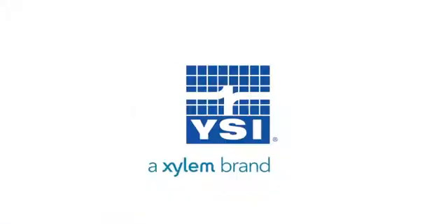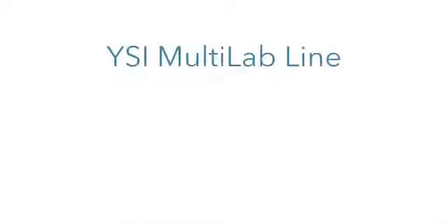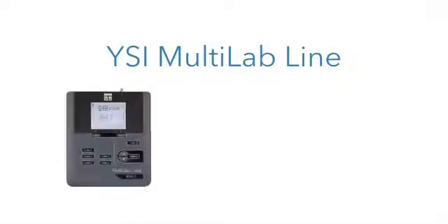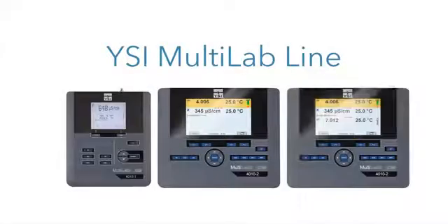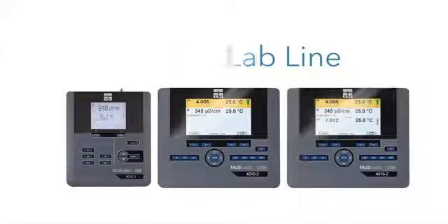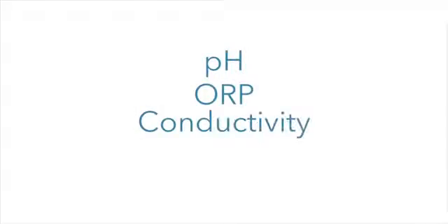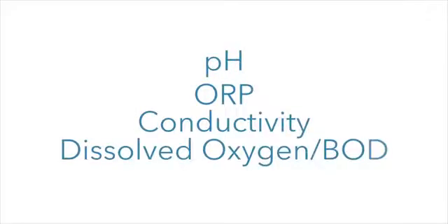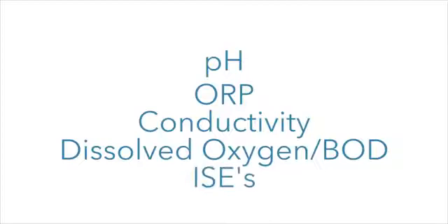The YSI MultiLab products provide an easy-to-use line of benchtop meters for the lab. The MultiLab line includes one, two, or three channel instruments for the measurement of pH, ORP, conductivity, dissolved oxygen, BOD, and ISEs. They are ideal for highly accurate lab testing.